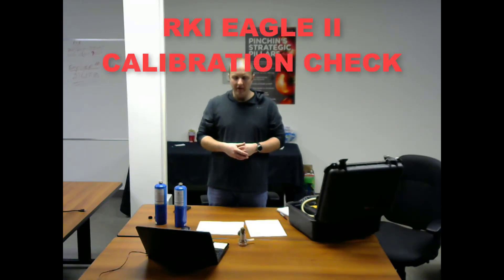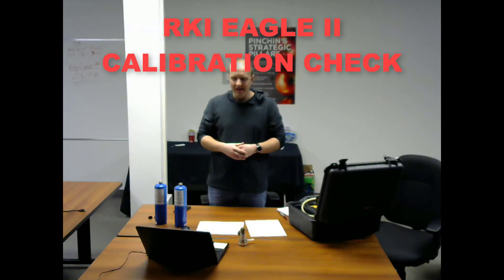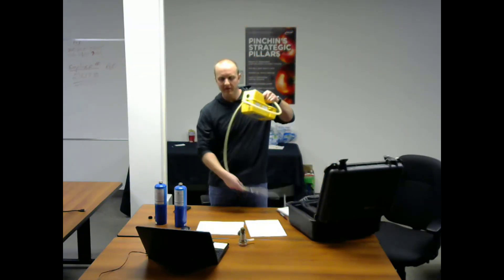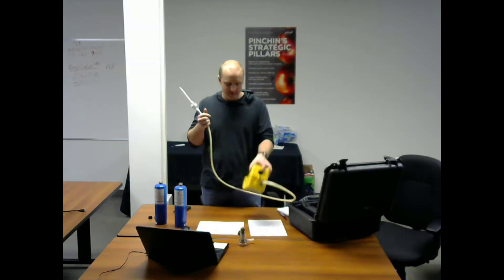Good day and welcome to this instructional video on how to complete a calibration check using an RKI Eagle II PID instrument. The very first thing you want to do in completing a check is to remove your instrument from its case and connect the tip of the instrument to the hose and subsequently to the PID. This one here is all set up already.